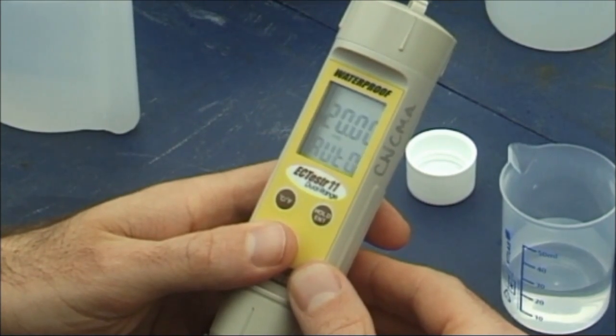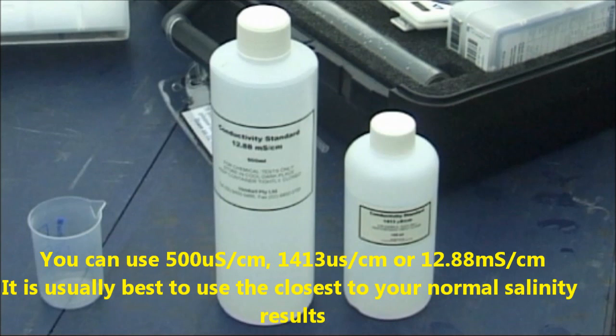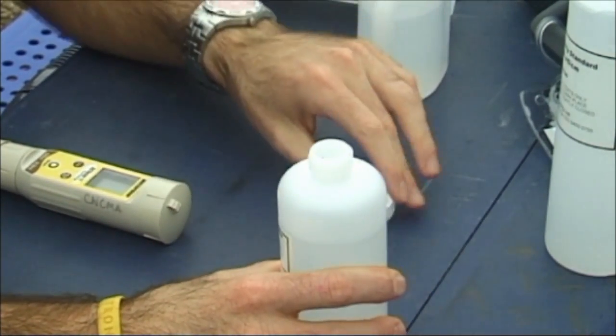To calibrate a dual range meter, you need to use two calibration solutions: 1413 microsiemens calibration solution and 12.88 millisiemens calibration solution. Start with the 1413 microsiemens solution.